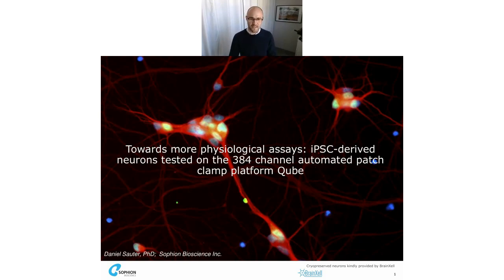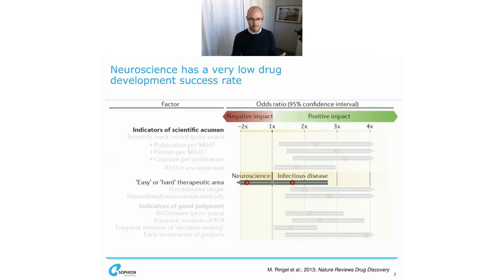But this data that I show, Mike did such a fantastic job to already set the stage and tell you about the relevance of using this technology and using iPSC-derived cells as a model cell. But I have prepared 3 additional slides that I just wanted to show here, because I want to provide some motivation why one wants to marry the automated patch clamp technology together with the iPSC-derived cell technology.